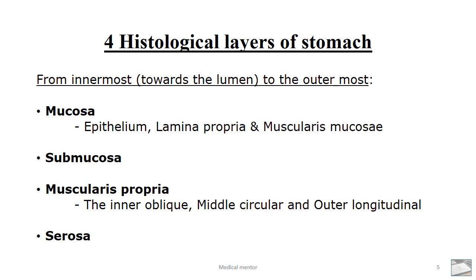The stomach is lined by tall columnar mucus-secreting epithelium. Then we have the lamina propria, which mainly has connective tissues, blood vessels, muscles, and lymphatics, and the muscularis mucosa. The muscularis mucosa has two layers: the inner circular and the outer longitudinal layer.